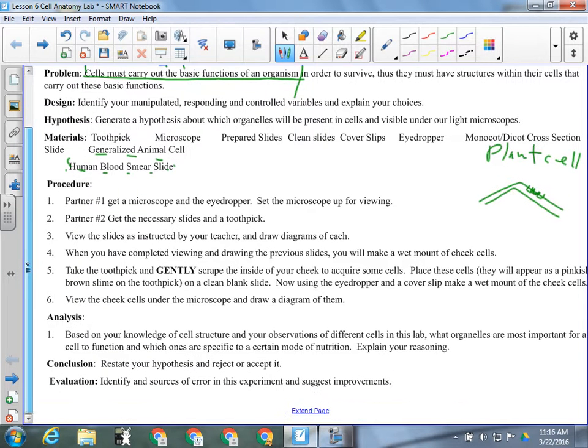All right, so same as last time. Once we get looking at the slides and you get a specimen focused really well, you're going to take a picture of that and send it to your group mates. The pictures I've seen so far on the microscopy lab have been excellent. They've turned out really well. We had a few issues so far with format, however. If you recall, it was important on a lab drawing for all the labels to be horizontal lines going to the same side. I do have a lot of sunburst style lab drawings where labels kind of go everywhere.